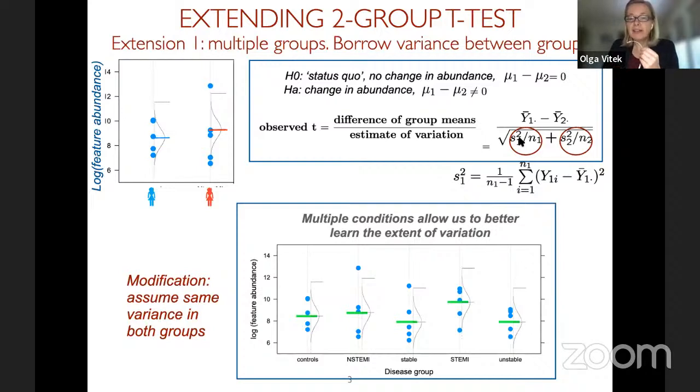And the other thing is when we have a small sample size, then occasionally those signals tend to be exaggerated, because, let's say, if we only had 2 replicates in this group, we have a replicate here, and in the other group we have a replicate here.